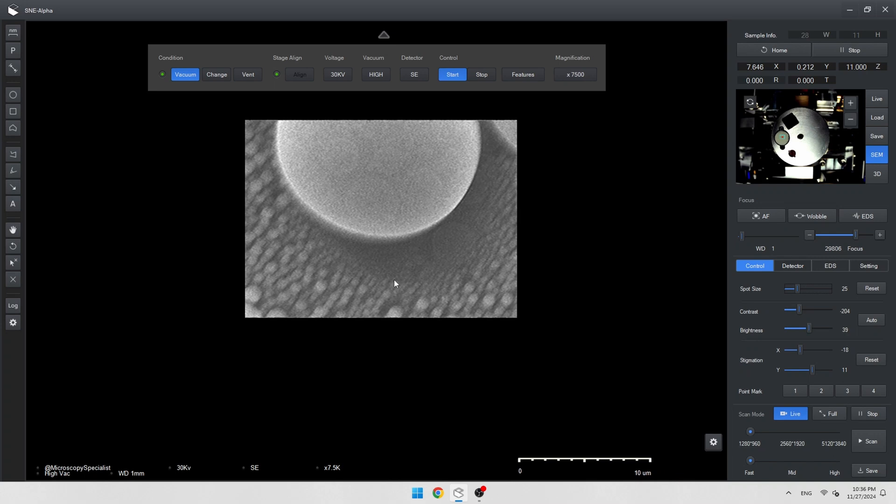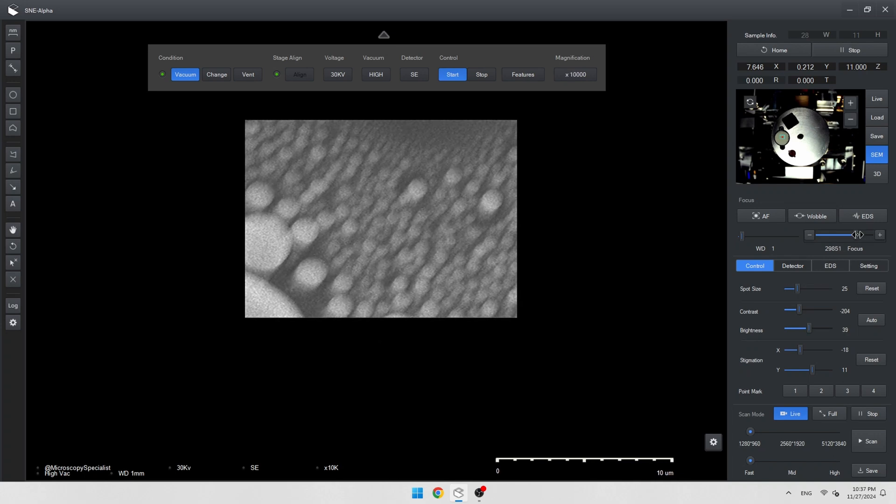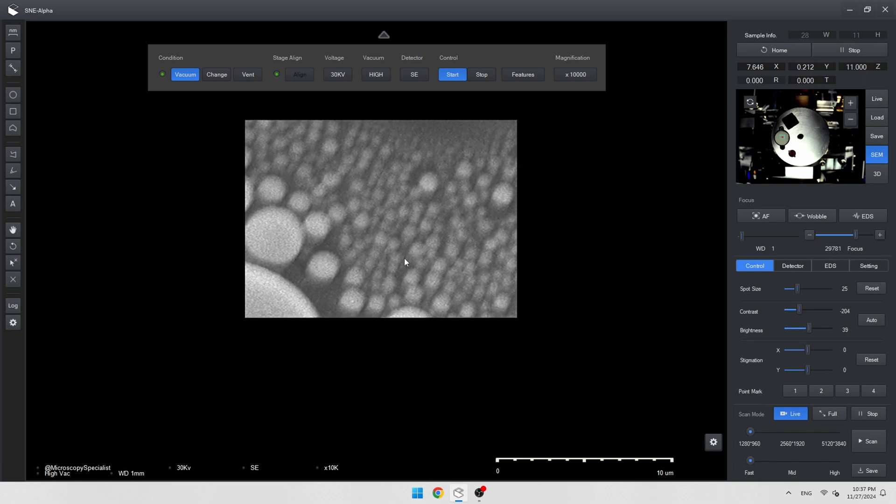Now we need to get an image. First 10k magnification. Let's find the focus. Okay, somewhere here.